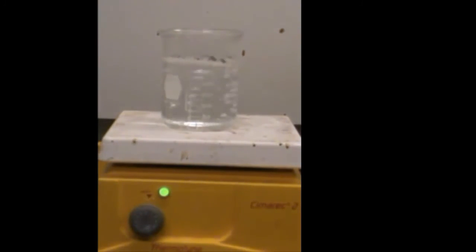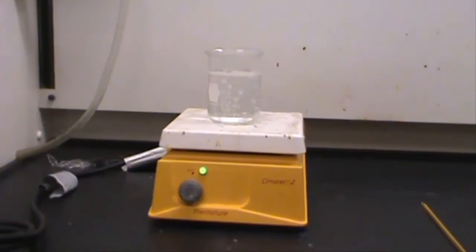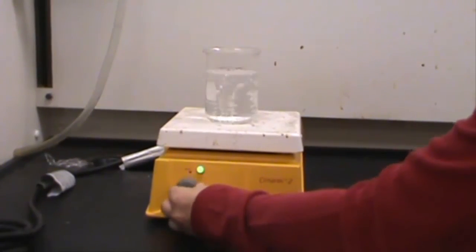The heating instrument used is called a hot plate. Hot plates are to be left in the fume hoods. Do not turn on the hot plate until after the beaker is on the hot plate, never before. You can shatter the glass if the hot plate is hot already. Turn on the hot plate to about 6 or 7. Turn the hot plate off by turning the knob until you hear a click.